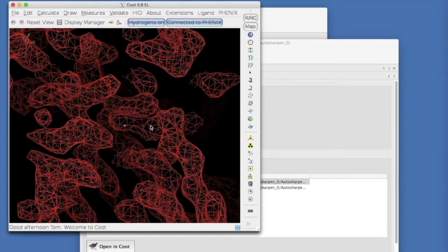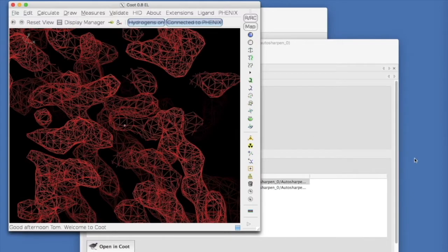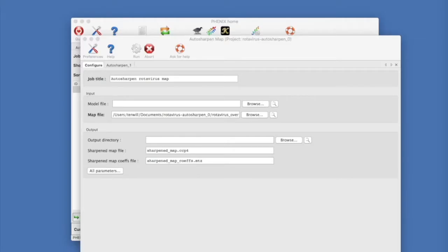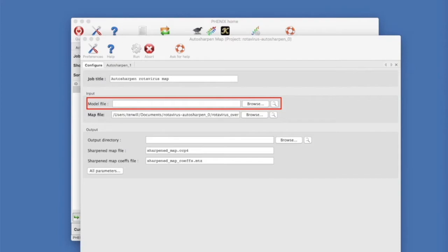Auto sharpen can also be used to optimally sharpen a map to best fit a model. In the auto sharpen window, you just enter the model. This can sometimes give just a little bit better sharpening than without a model, but it also has just a little bit of bias towards the model.